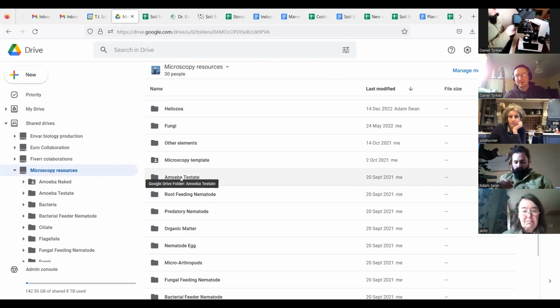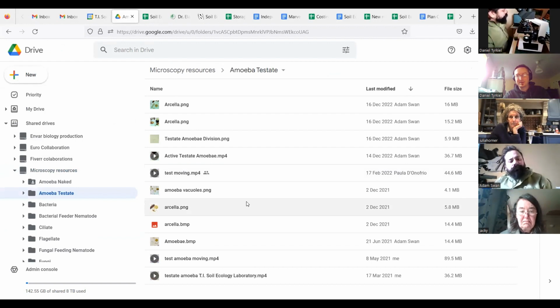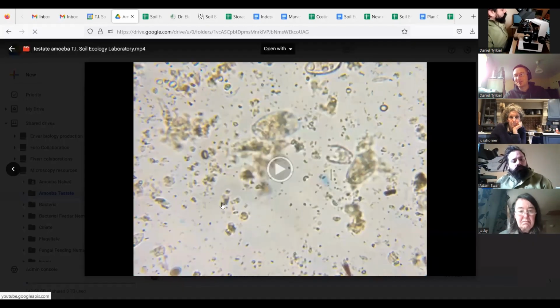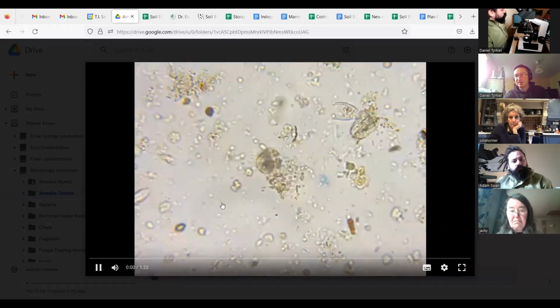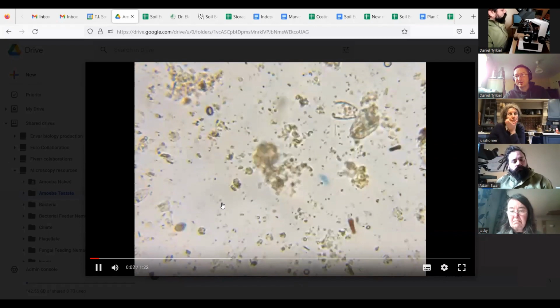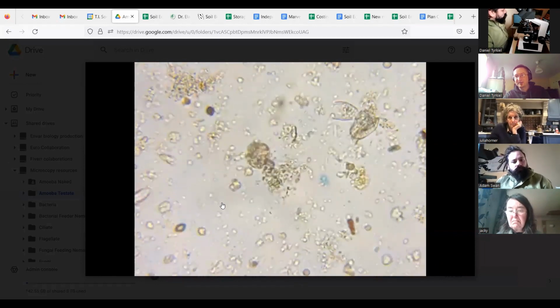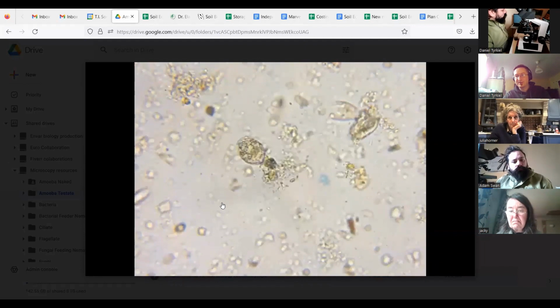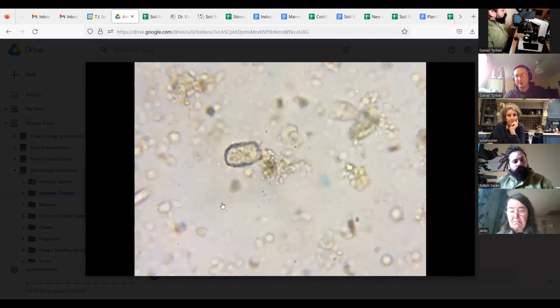The testate amoebae, for instance, that we looked at on Adam's screen, we have come across ones that were actually moving, and this doesn't happen very often. So we've collated this library of images and videos for you to be able to learn quicker.